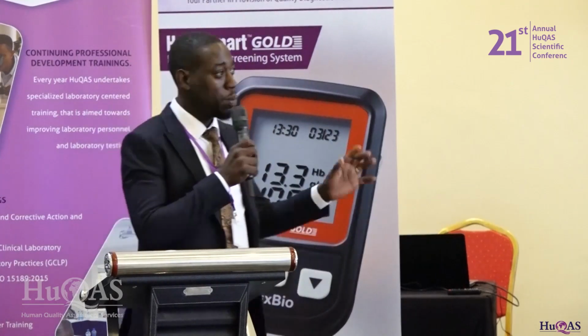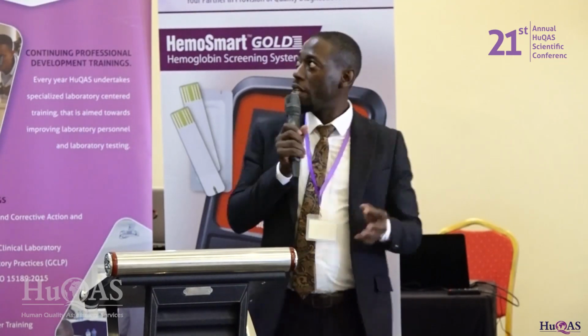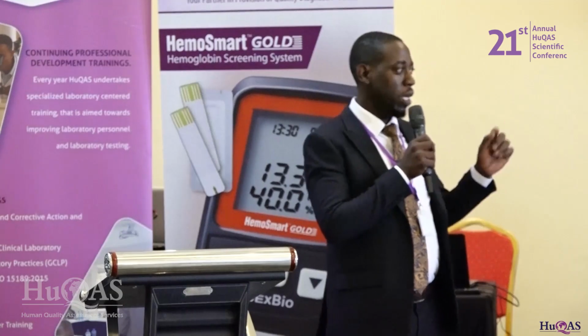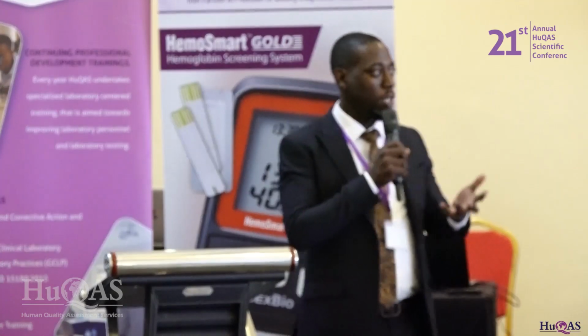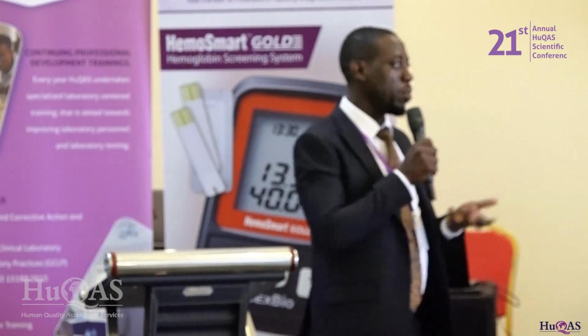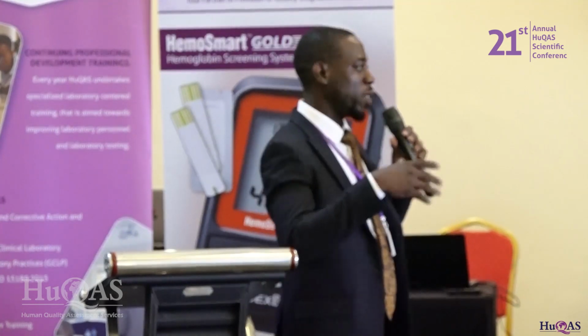Okay. So we used the WHO SLIPTA checklist, looking at the essentials of the system. And we also did interviews, observations, and document reviews. This was basically focused on biobanking. We also had to retrieve isolates which were kept and subculture them to see if they are still viable, because you may keep samples, but by the time you need them, they are not viable. And I'm sure that happened many times in cases of COVID. They were positive, but by the time they were requested for sequencing, they were not coming up. Maybe the viral loads had gone low, so that you couldn't pick them for sequencing.